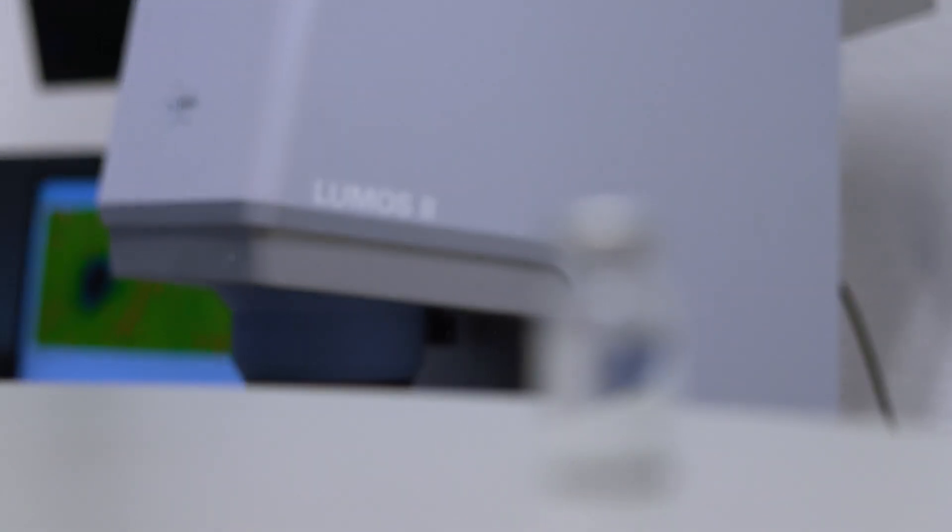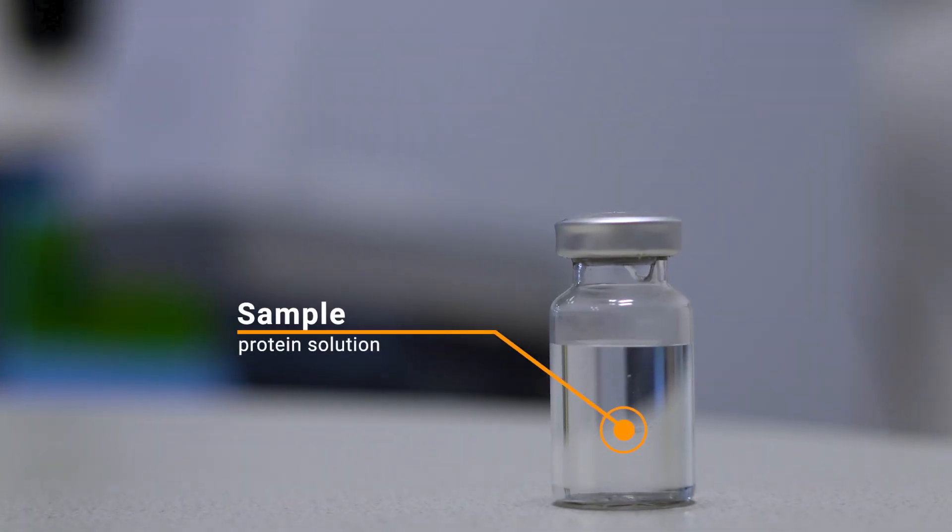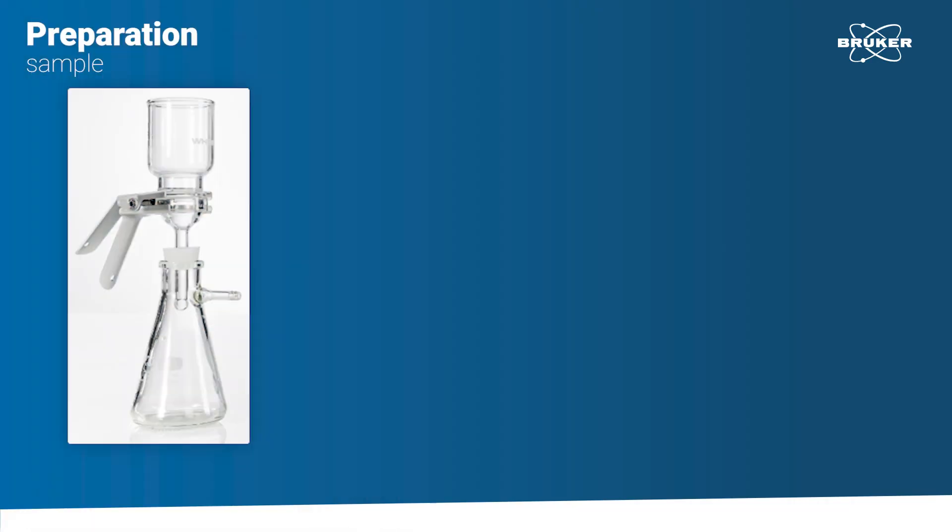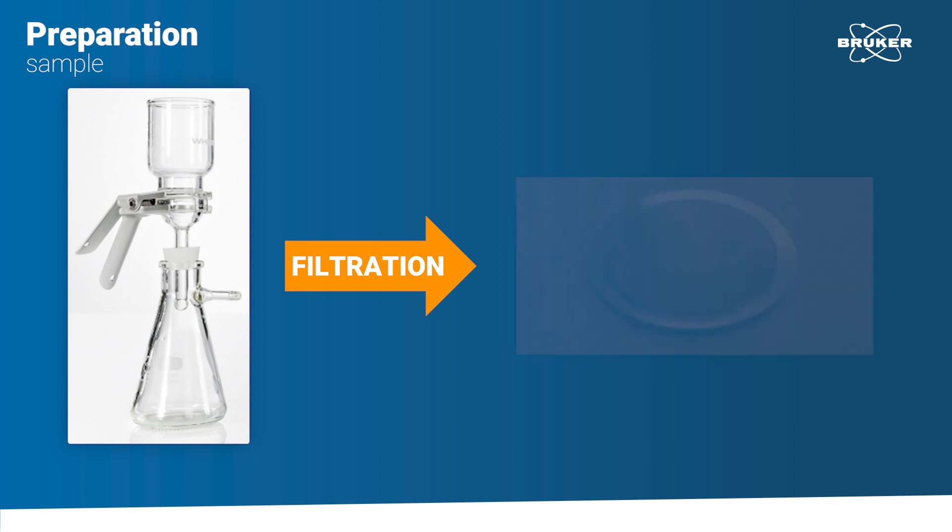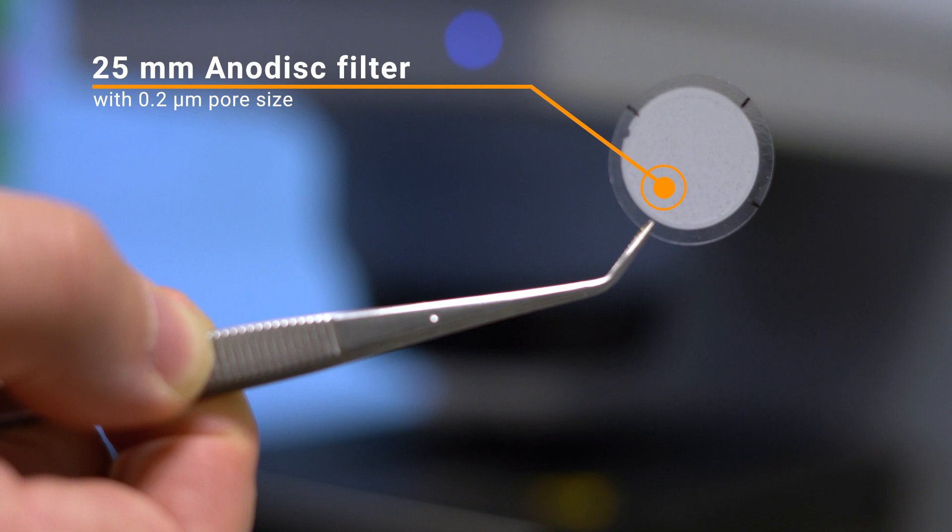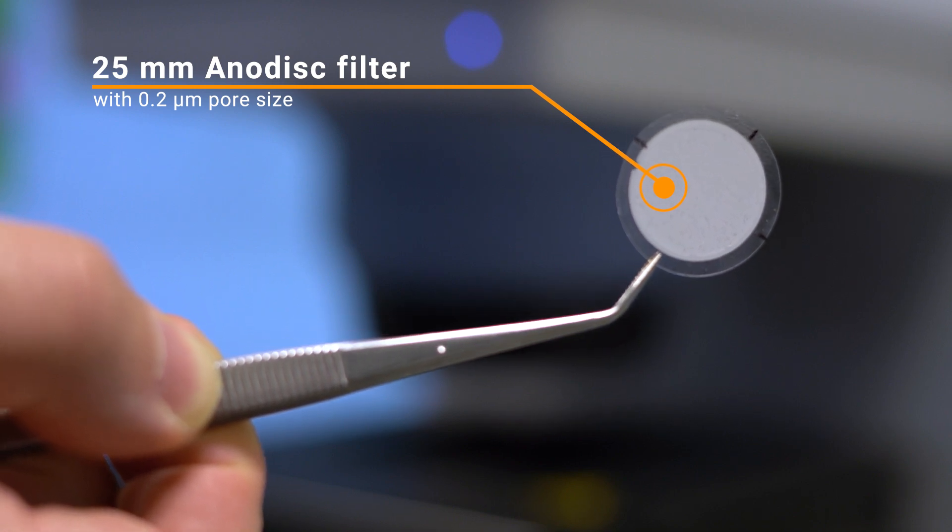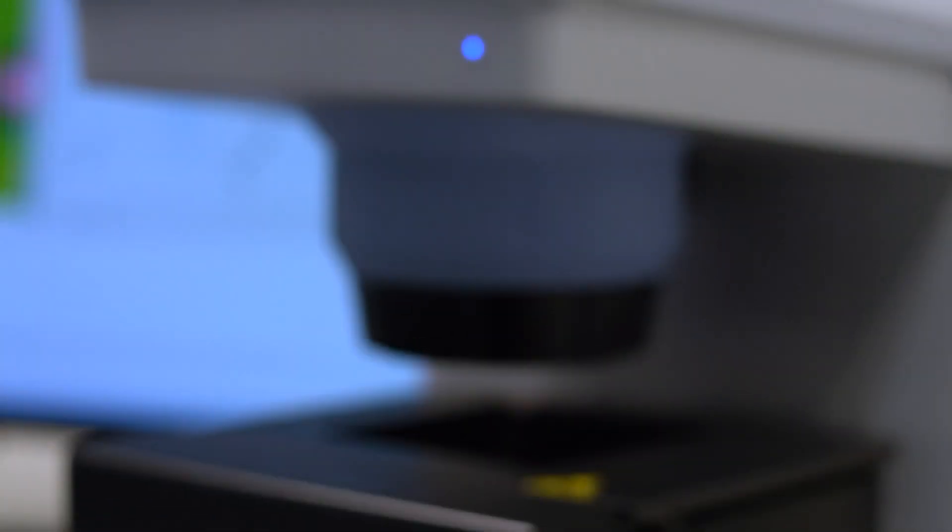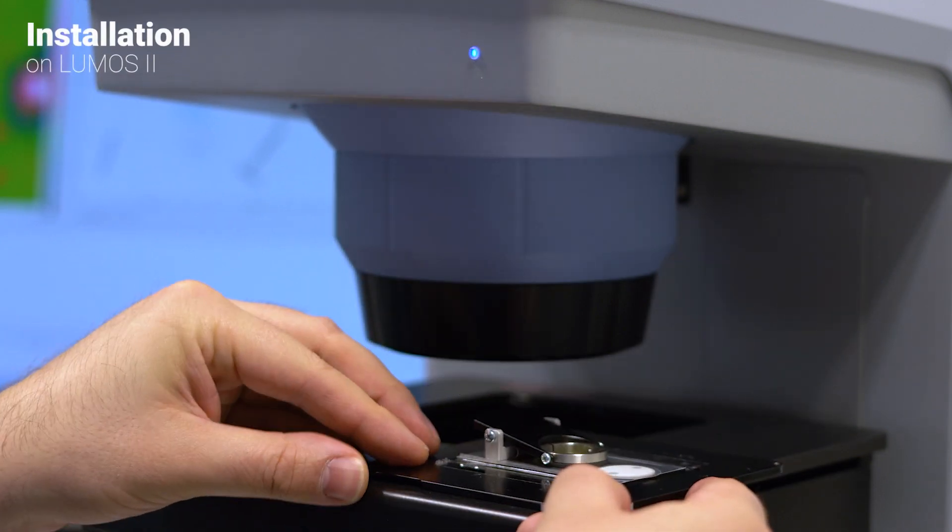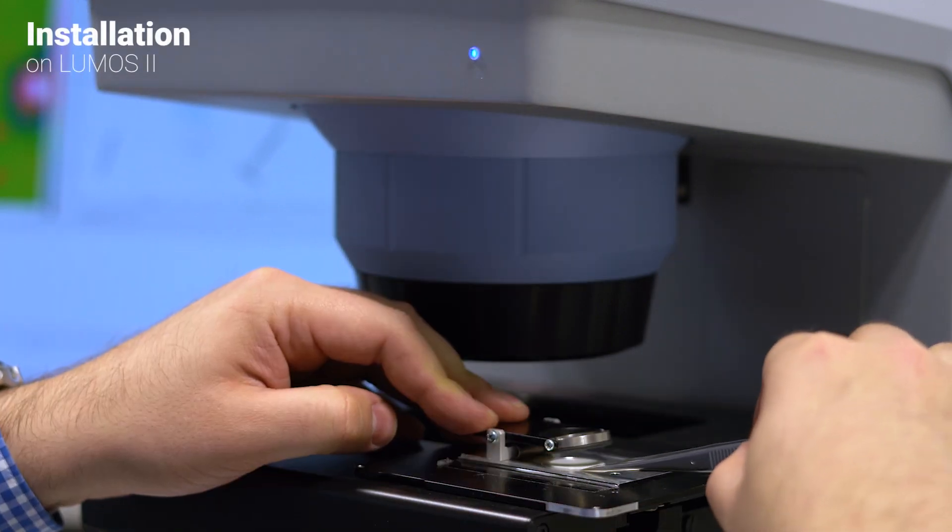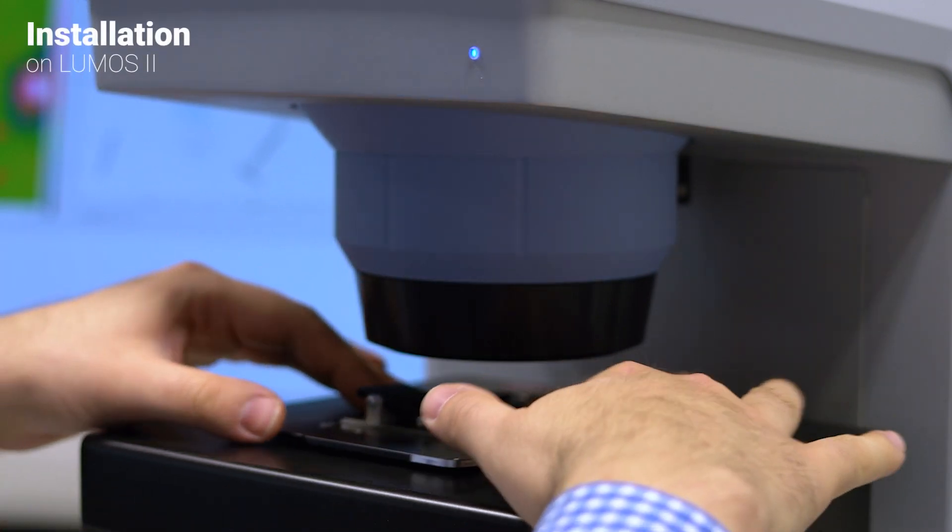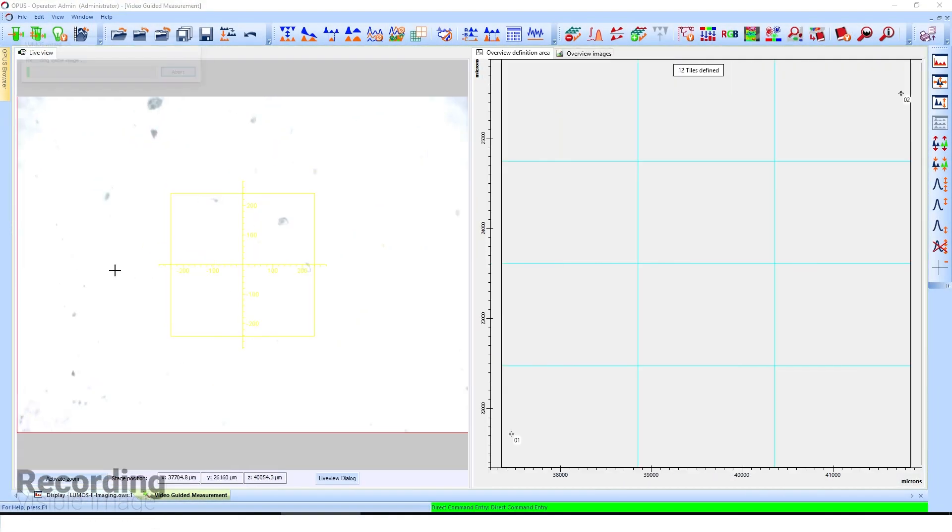we prepared a protein solution, which could be anything from antibodies to insulin. As a first step, any particulate matter must be separated from the liquid phase. The sample was opened and filtered onto a 25mm anodisc filter with a 0.2 micrometer pore size. When the particle-loaded filter is dry, we mount it on the spring-loaded sample holder and insert it into the Lumos II to start the analysis.